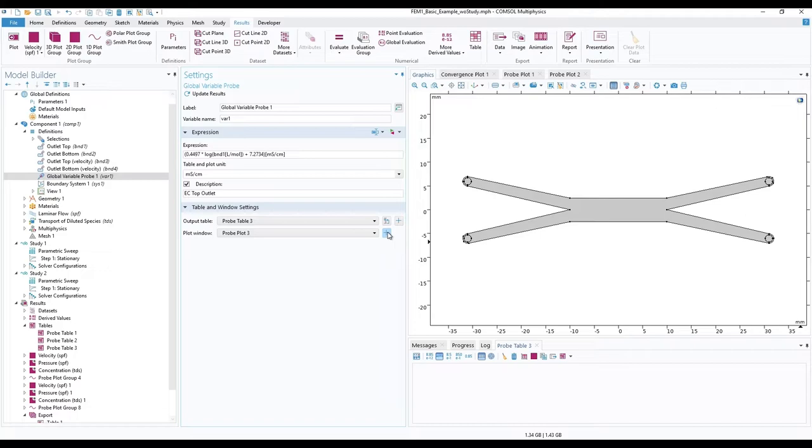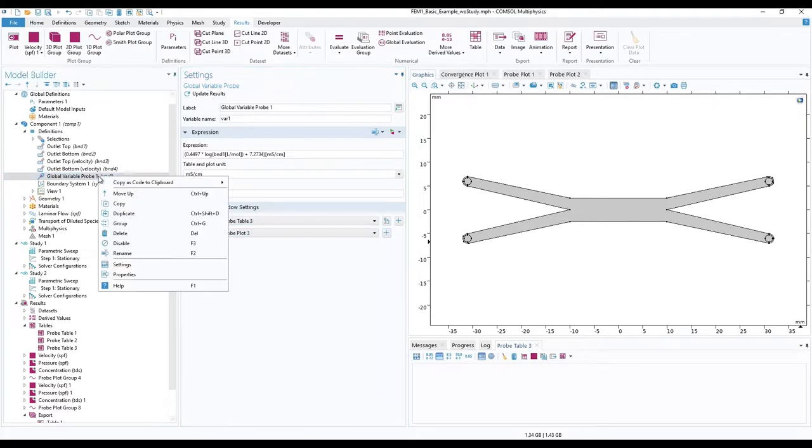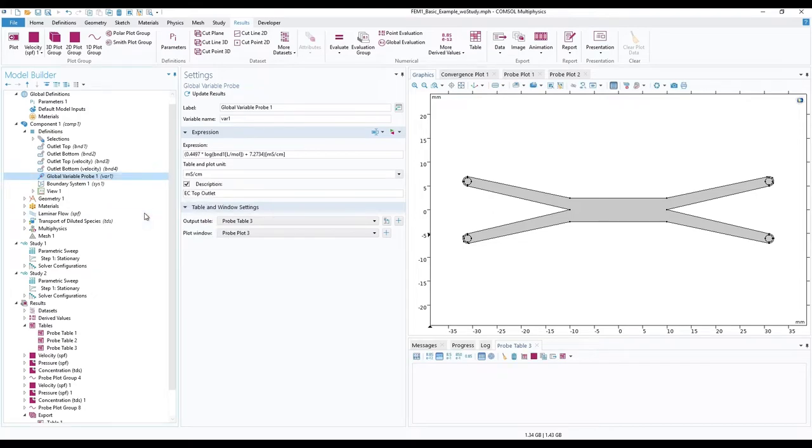To simplify the process for the bottom outlet, in the model builder ribbon, right click on the global variable probe 1 and click on duplicate.